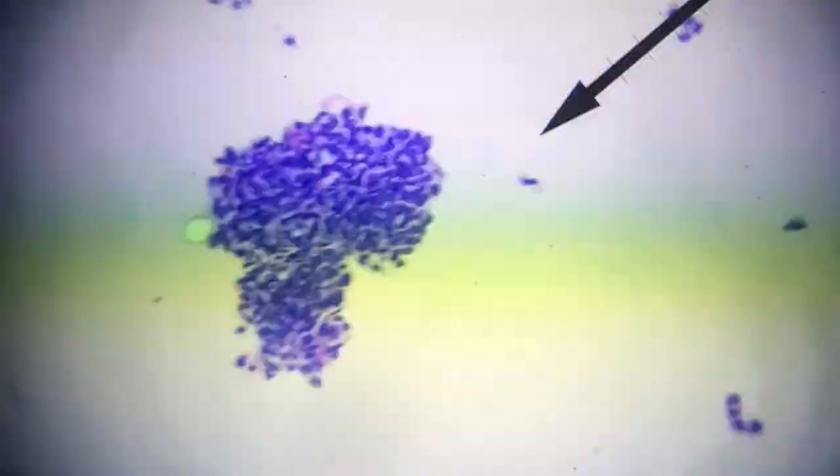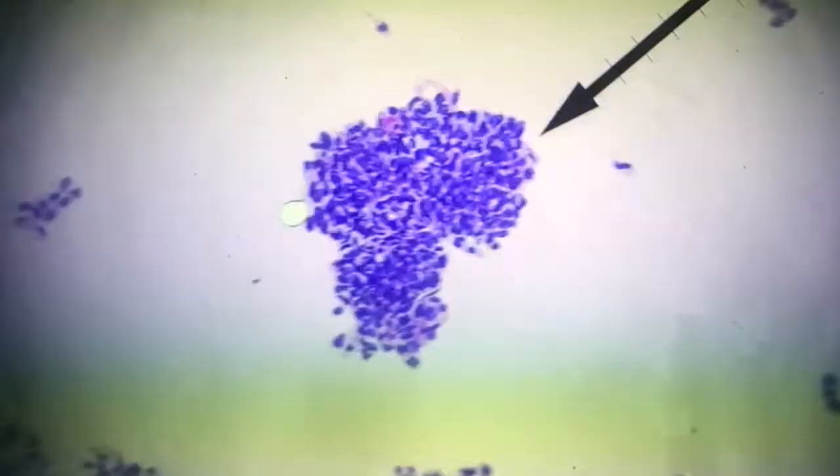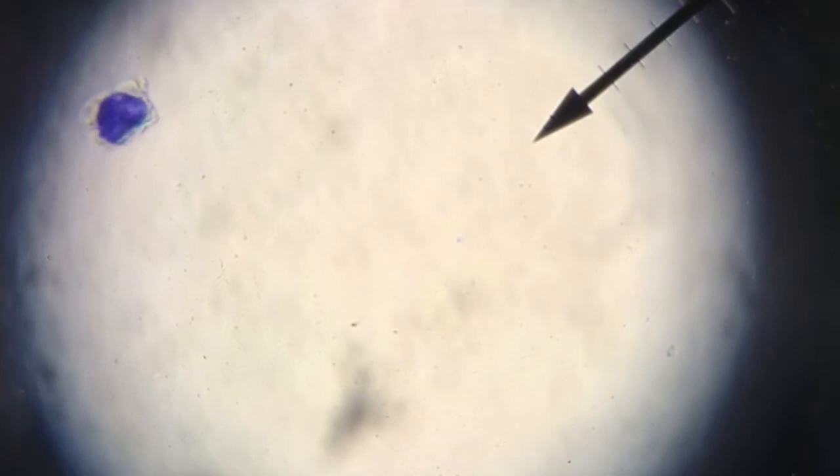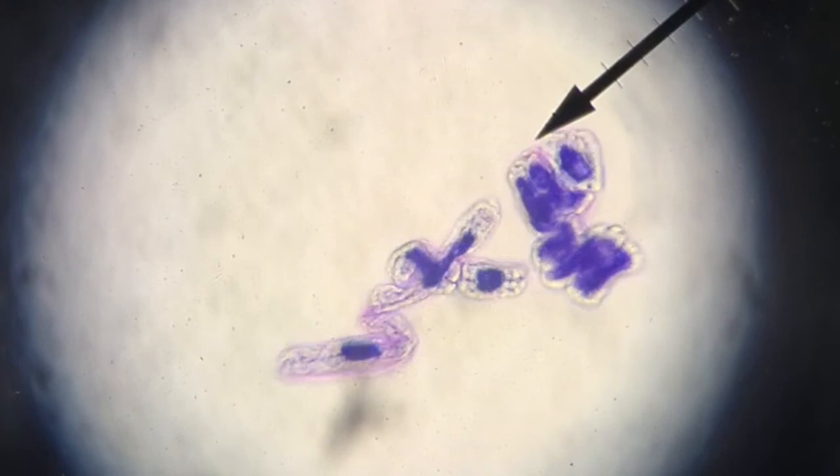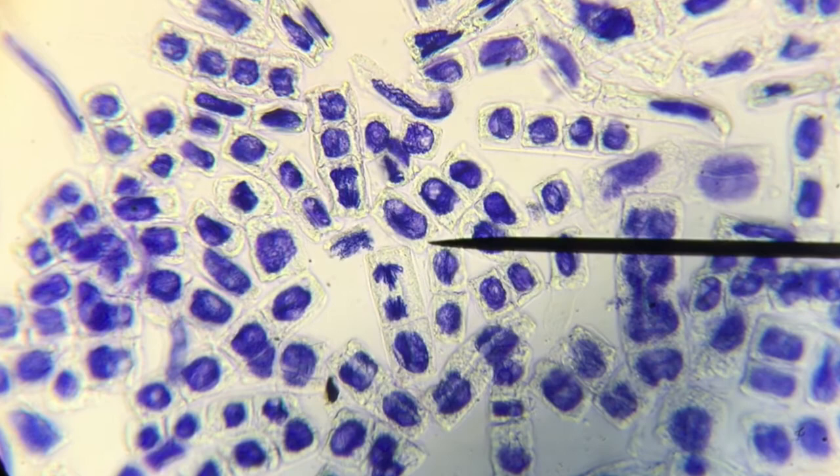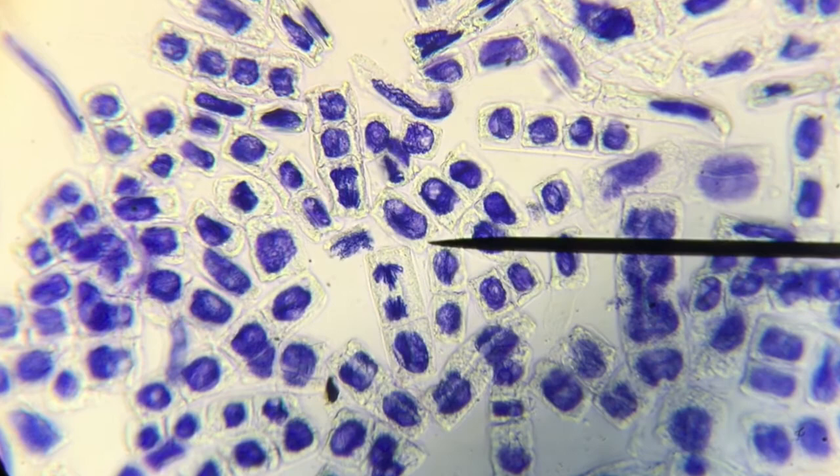This is our sample on times 4 magnification. On times 10 magnification we'll do times 40 magnification. Then we're going to move up to our times 100 magnification. You still can't see all of the cells in detail but they're nice and spread out. So I'm going to pick a nice group of cells. Finally let's push it up to the times 400 magnification. There we can see plenty of cells. Now it's just a case of hunting around until we find one that's in a stage of mitosis. Just there in the center where we've got the arrow we have a cell in anaphase because you can see two spiders kind of pulling apart from each other. That's on our times 400 magnification.